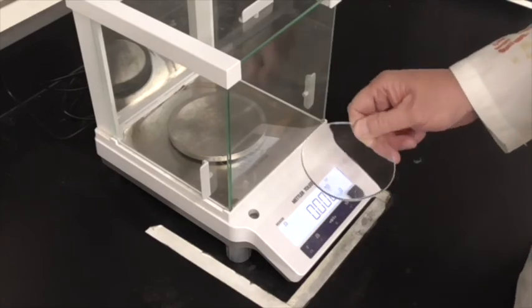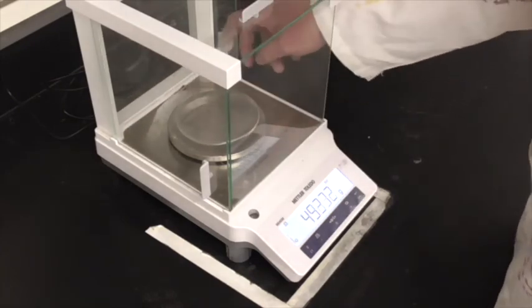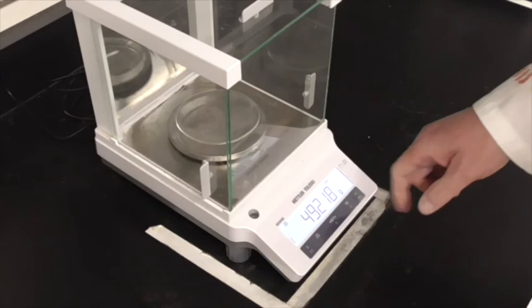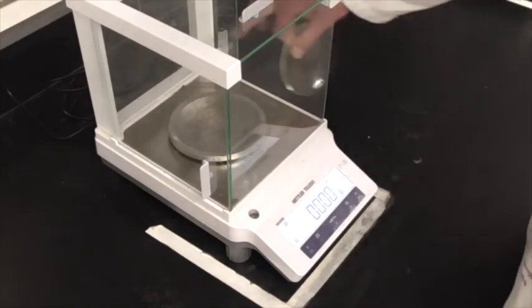So I want to weigh the watch glass so we can just weigh the whole thing tomorrow with the aspirin on it. So that watch glass has a mass of, let's stop shaking there for a minute, 49.218 grams. So now we can take our filter with the aspirin on it and put it on the watch glass.